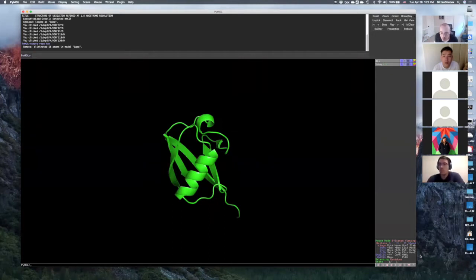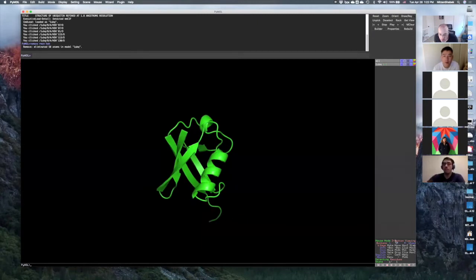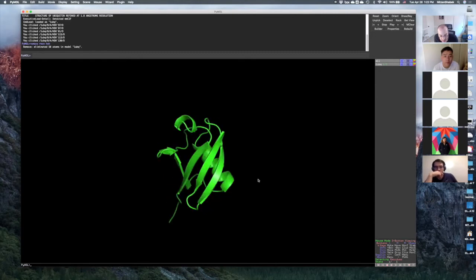If by accident you press on that, you can change some of these things that you can do with the mouse, okay? But essentially you can see everything that is happening. This is left click, middle click, right click, and wheel, okay? You can see what happens if you press left click plus shift, left click with control, left click, control shift, and so on, okay? So you can see that if I just press the left, I rotate, okay?